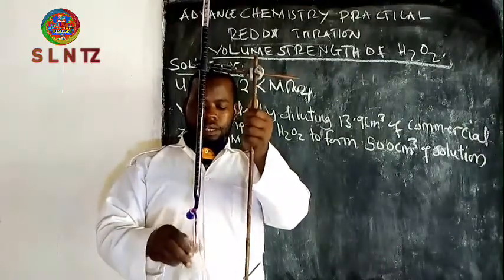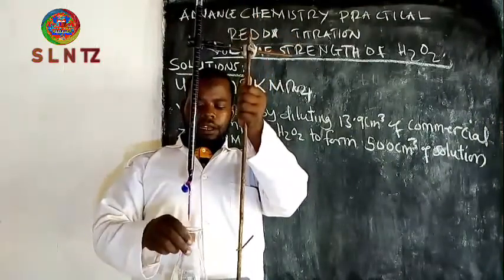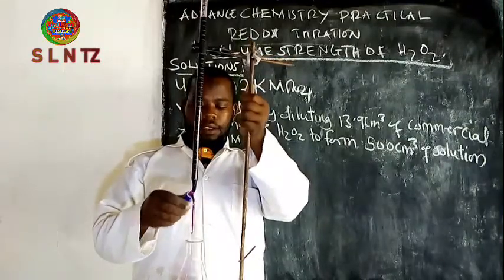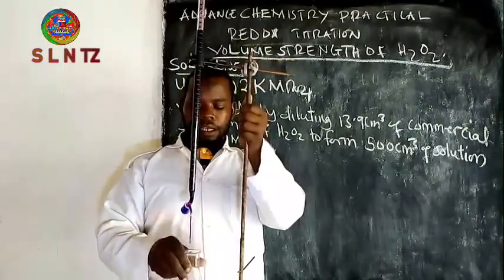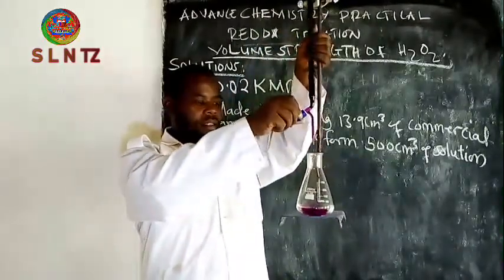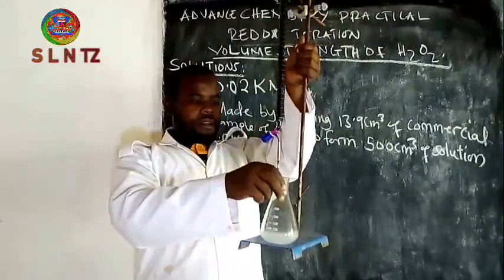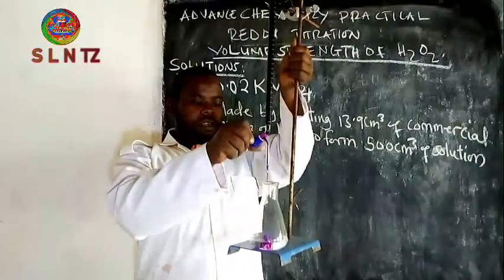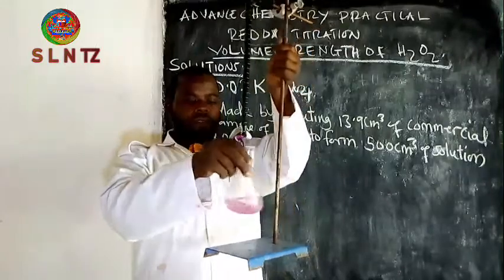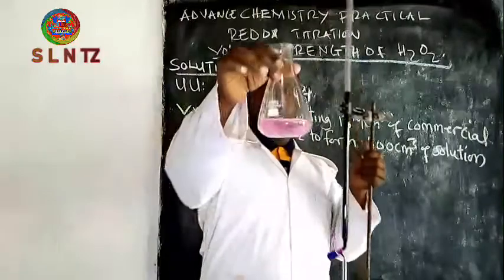You see, the pink color is coming and it disappears. So you see the ending color change with this one. So this is pink color.